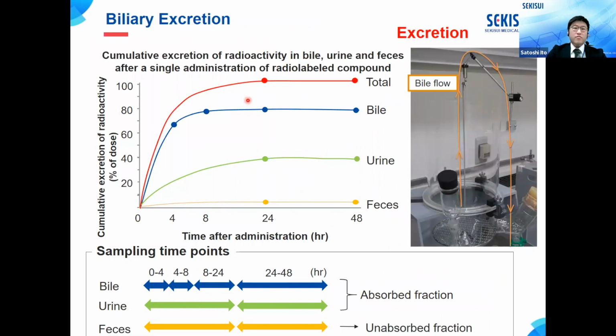The biliary excretion study will be performed as well as urinary and fecal excretion study. Rats are kept in a free-moving condition with cannulation of the bile duct. In most cases, the collection time is up to 48 hours after administration.